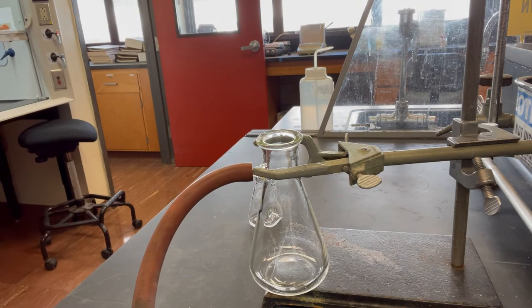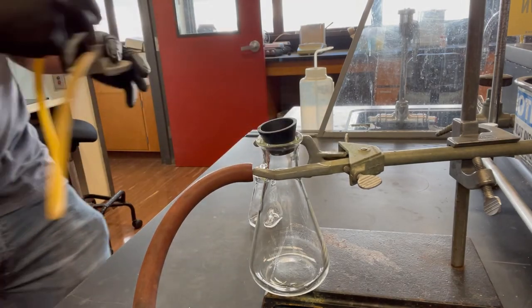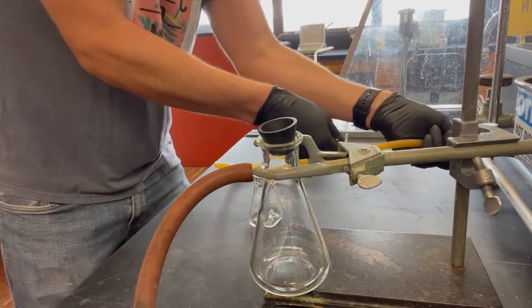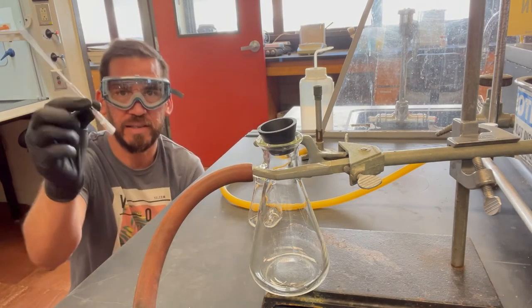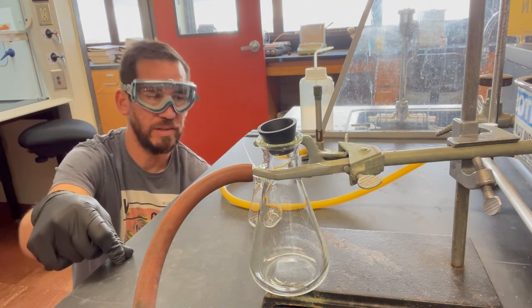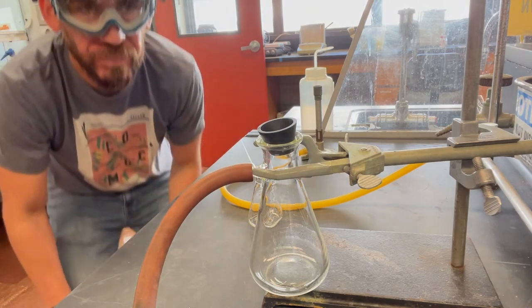So what we're doing now is gotta get that. All right, found my little adapter here. I'm also getting this Bunsen burner, because I told you a long time ago, or last week probably, that we could make capillary tubes by melting these guys and then stretching them out. So I just wanted to show you that. The capillary tube is going to be used for spotting our samples. So that's really what you do in the lab. You already saw it, but I'm going to do it and then use it. So cool stuff, right?